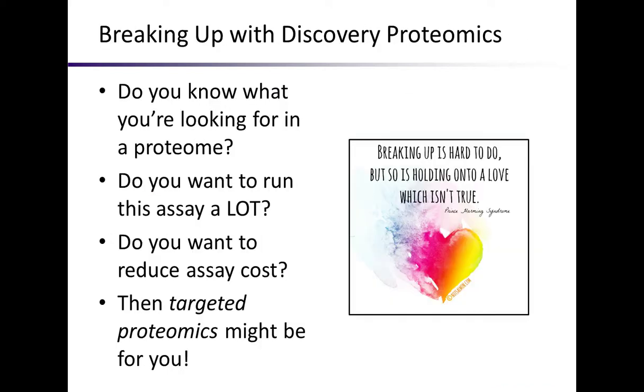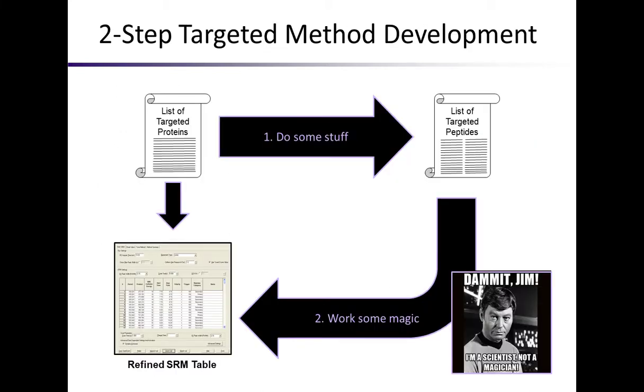But in this talk, one of my goals is to convince you that sometimes we need to break up with discovery proteomics, right? It sounds really nice. We're all very scared of not seeing something that might be there. But if you know what you're looking for in a proteome, if you want to run an assay a lot, if you want to reduce your assay cost, you might need to do targeted proteomics, okay?